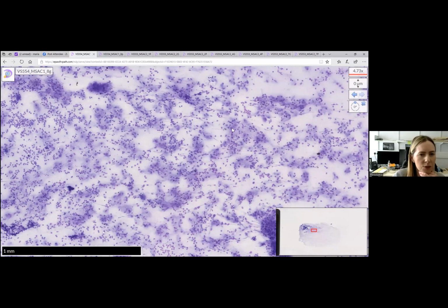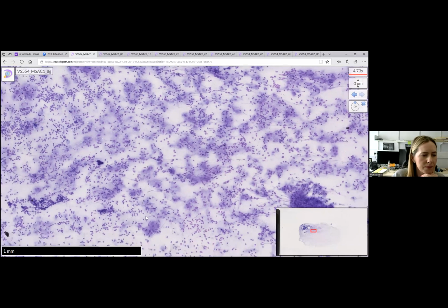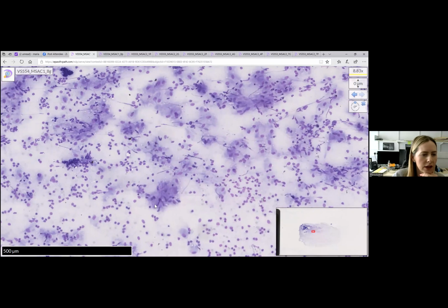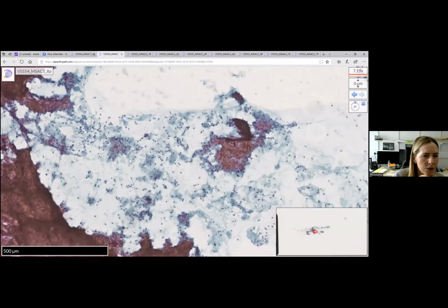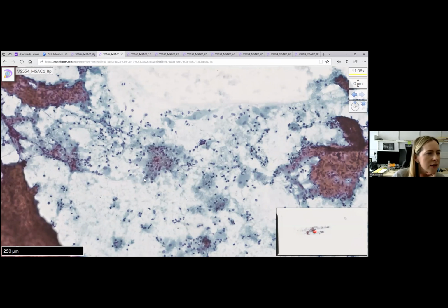So essentially what we have here, and then also in the background, and then just to assess the morphology of the nuclei and the quality of the cytoplasm. And then if I just take you to the PAP, where you have similar aggregates of these cells.